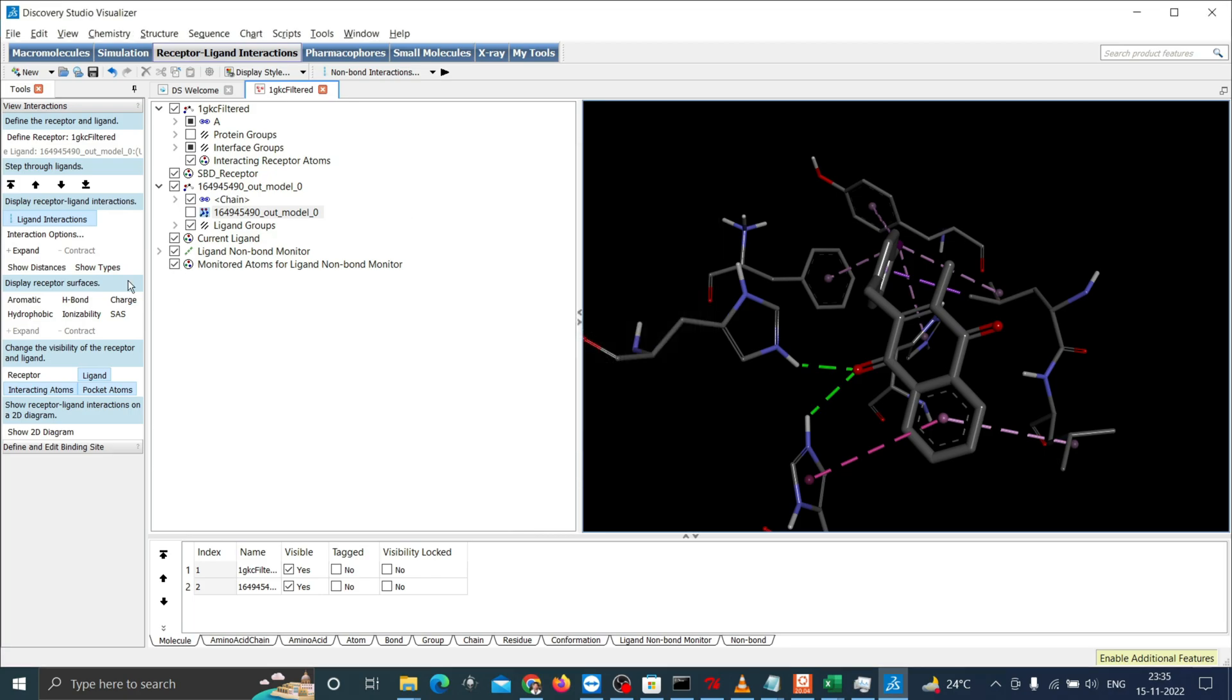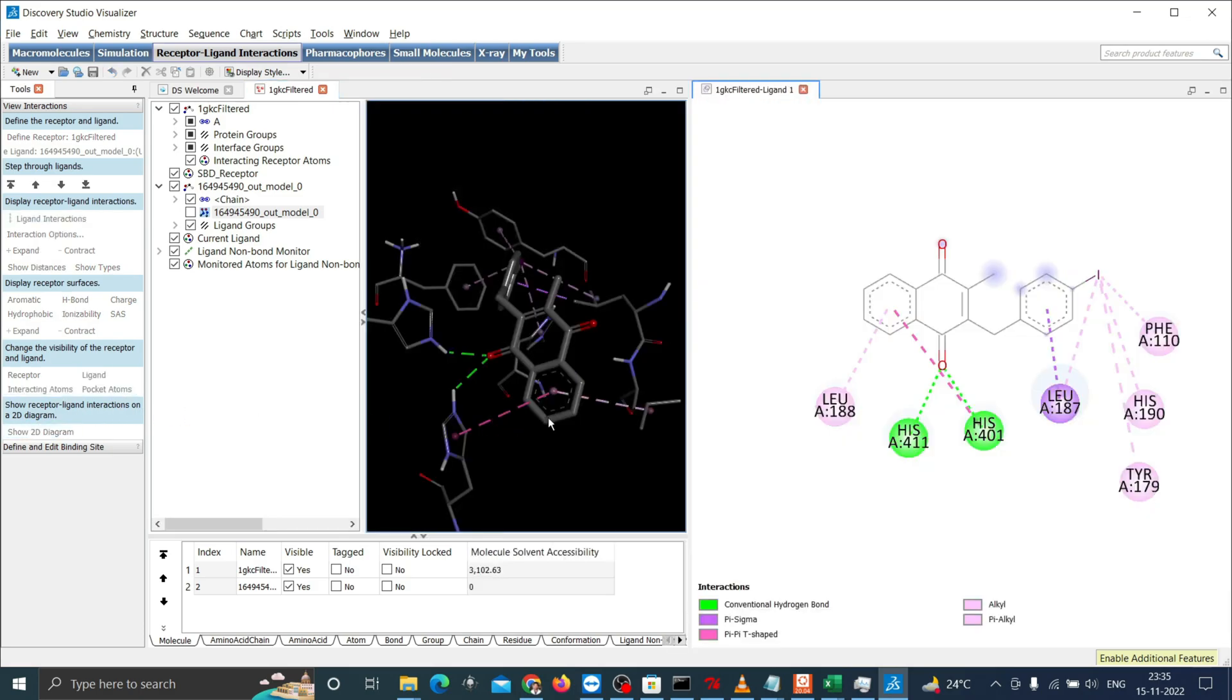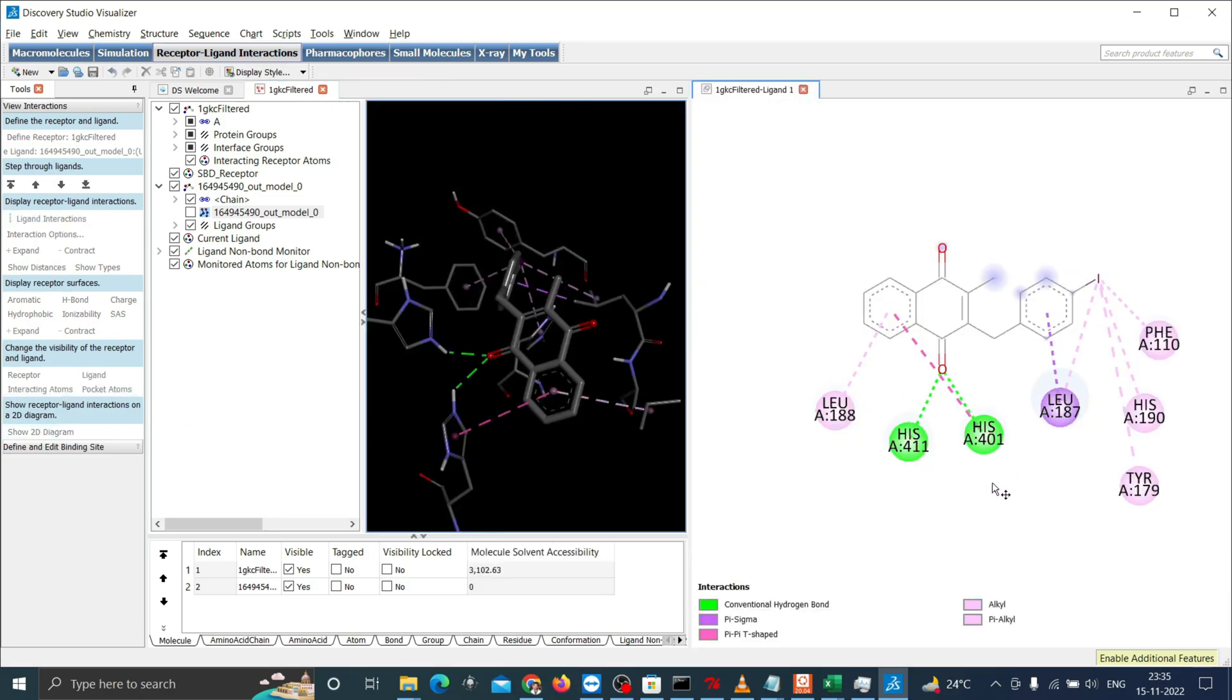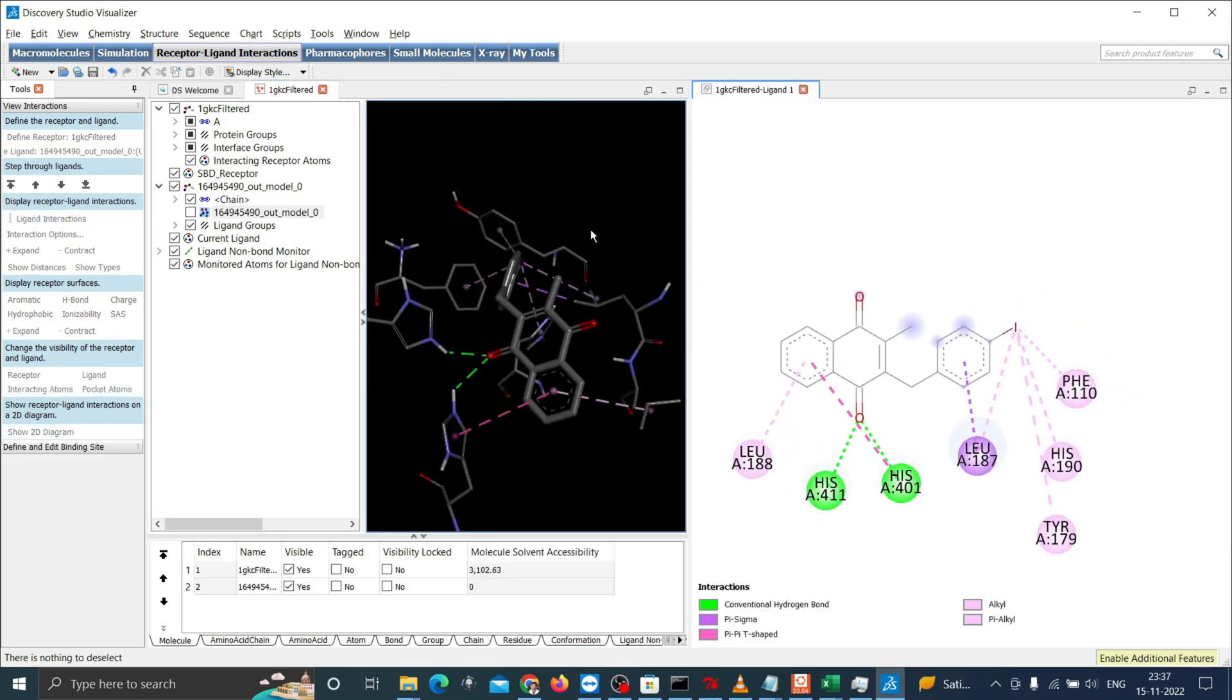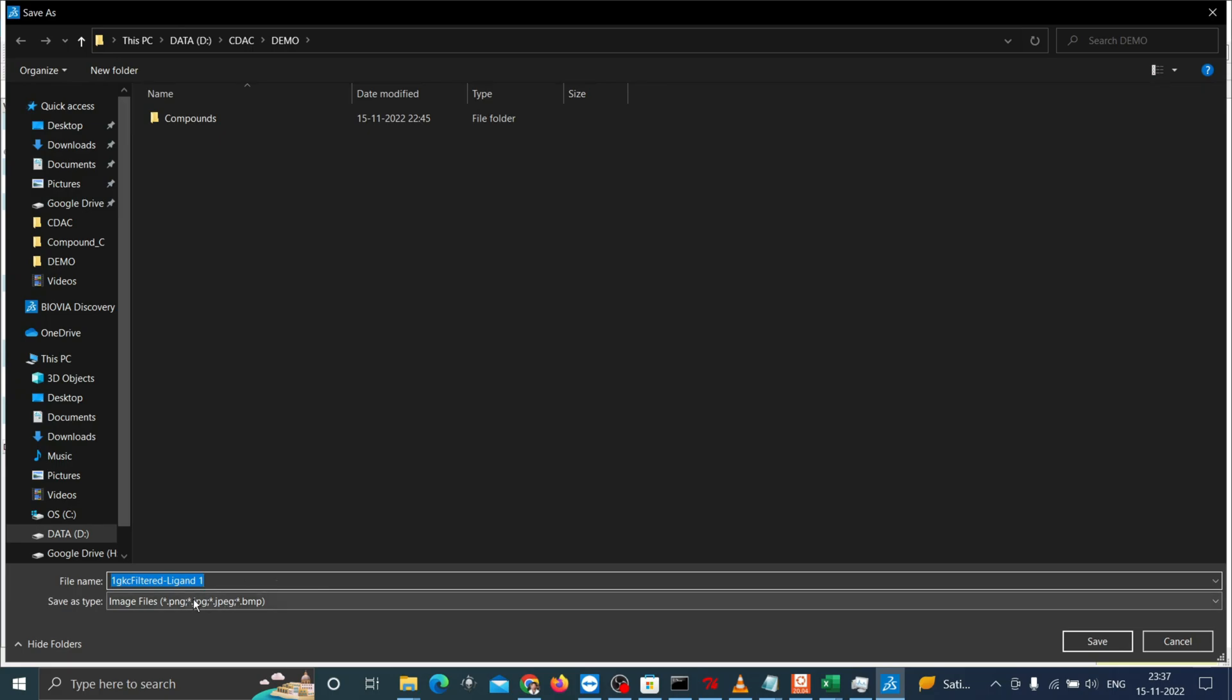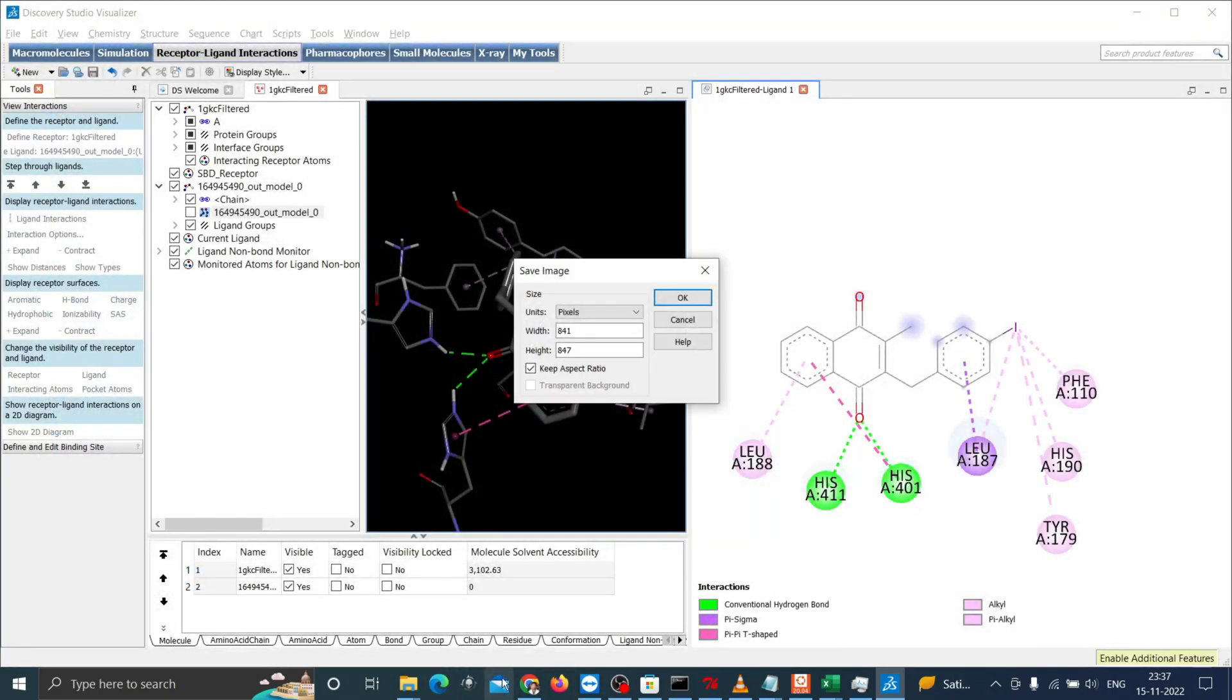You can also view the interaction in 2D by clicking show 2D diagram. Now you can save this image in your directory for publication purpose. You can choose which size you want to save it. Now the image is saved.